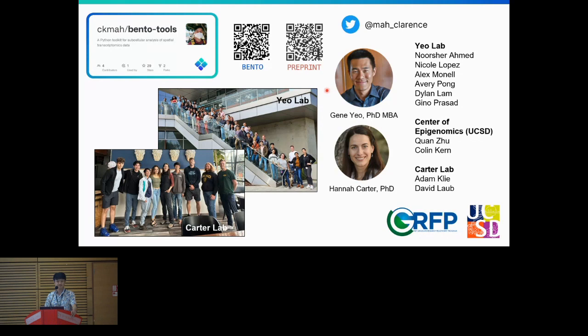Thanks. So cells are not perfectly flat, which means that when you have the spatial transcriptomic data, you will have noise. How do you handle that? Yeah, great question. So the data sets I showed today are all from cell lines in a dish. So for the most part, they are pretty flat in a monolayer. The cardiomyocyte data set I showed, we actually did have some issues with the later time points being very dense, so cells sitting on top of each other.